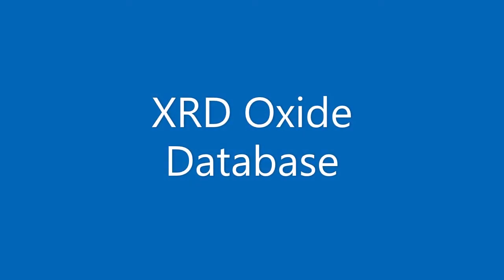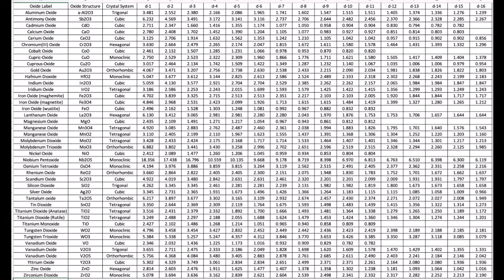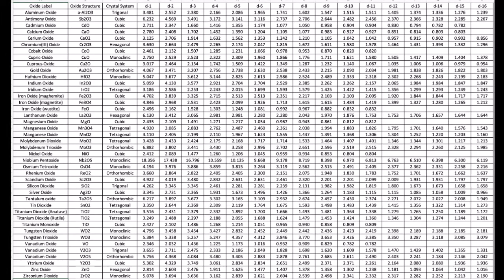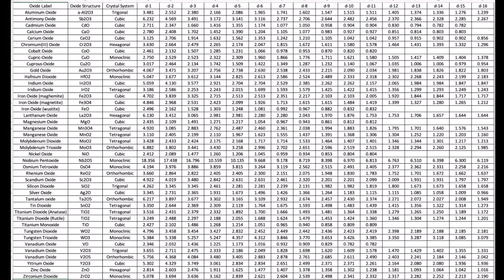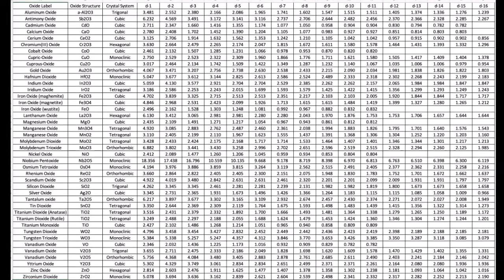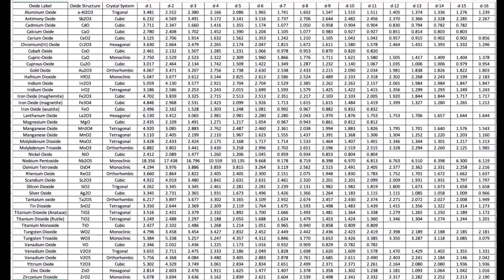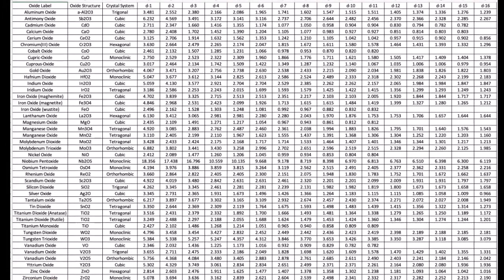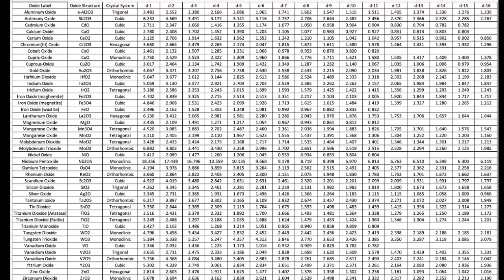Your assignment is to use the collected X-ray diffraction patterns to identify the d-spacings of the peaks in the patterns for each sample. Then create your own matching routine using the data in the Excel file of the database and the peak positions that you determine for each sample's X-ray diffraction pattern.